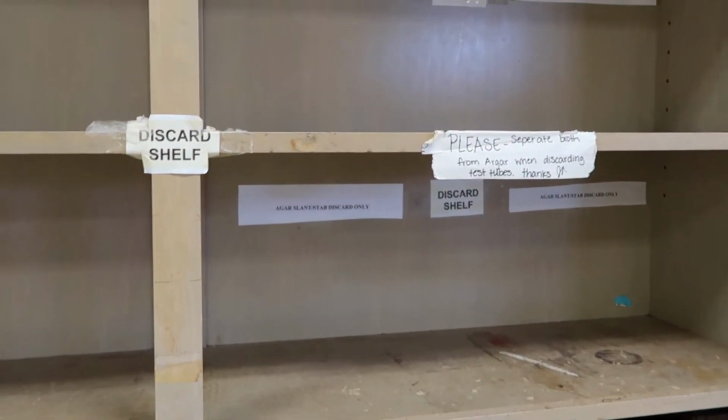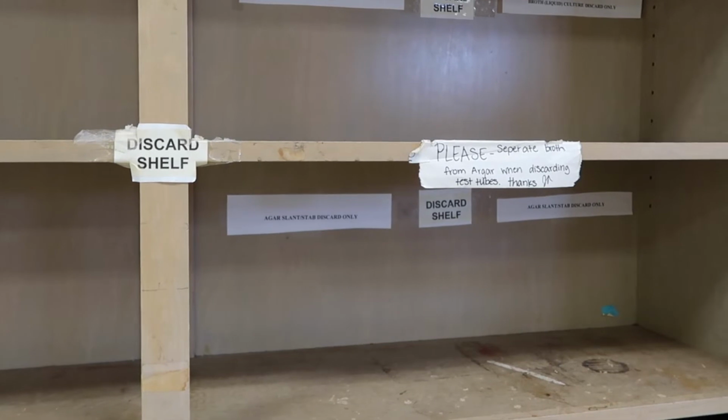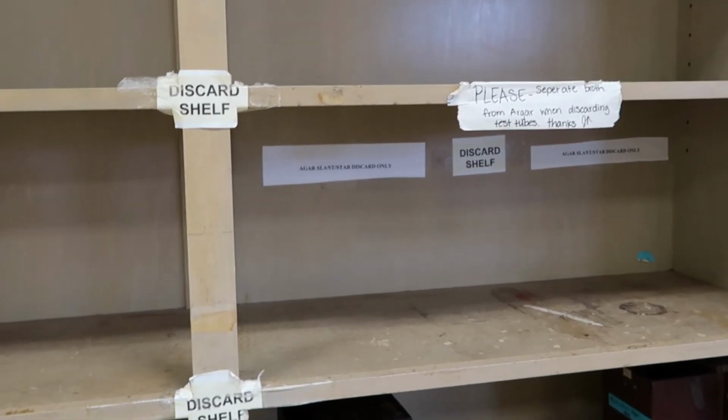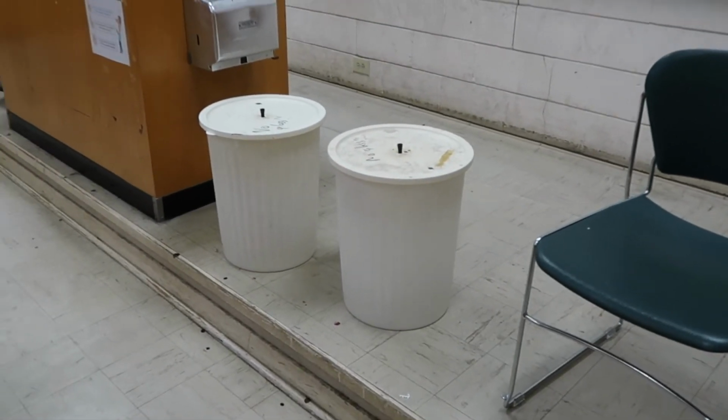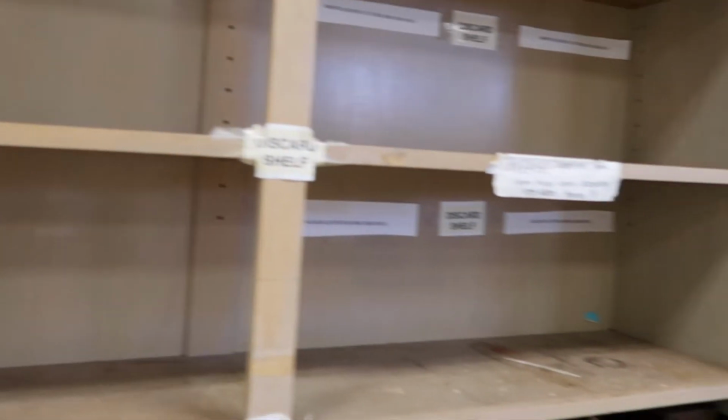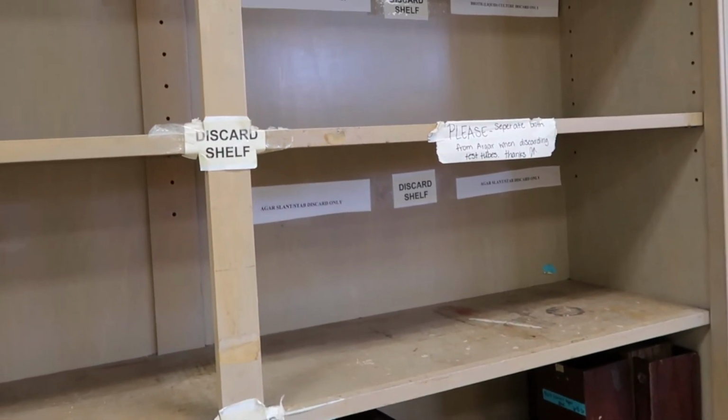So when we say that we're done with these tubes, you can put them on the discard shelf. This is where we're meaning. And only test tubes go on here. Petri dishes do not. Petri dishes are going to go in the biohazard, okay? So again, Petri dishes go in the biohazard, and then test tubes are going to go on the discard shelf.